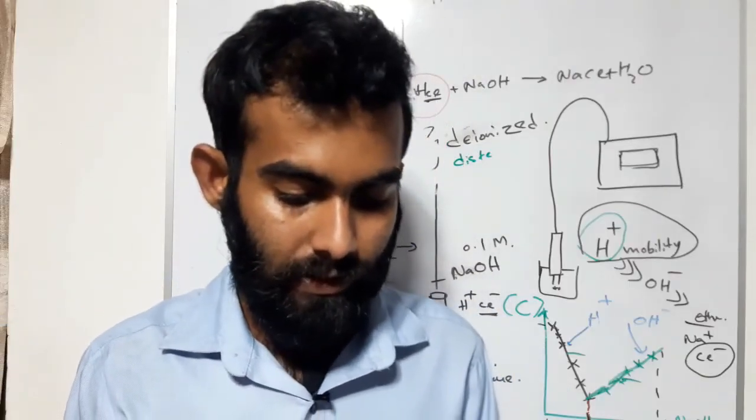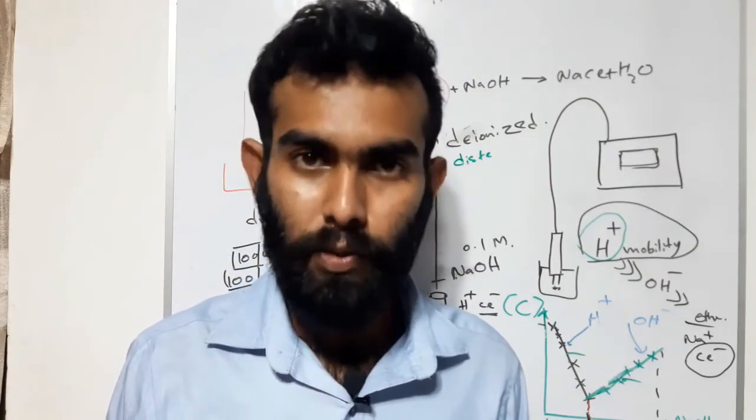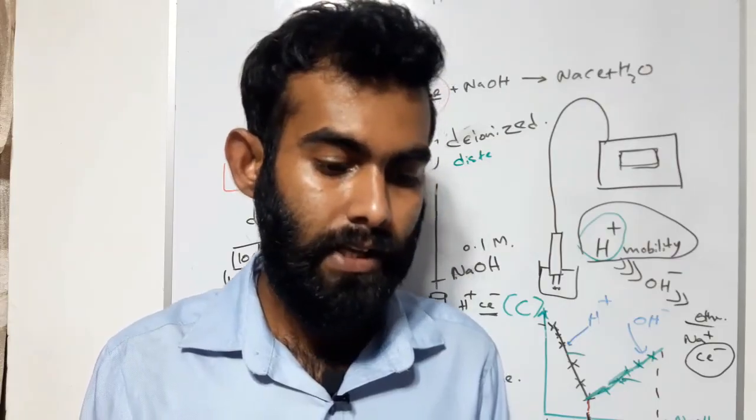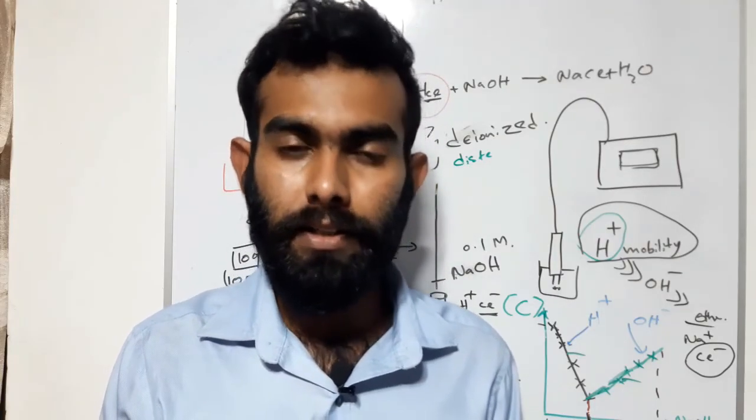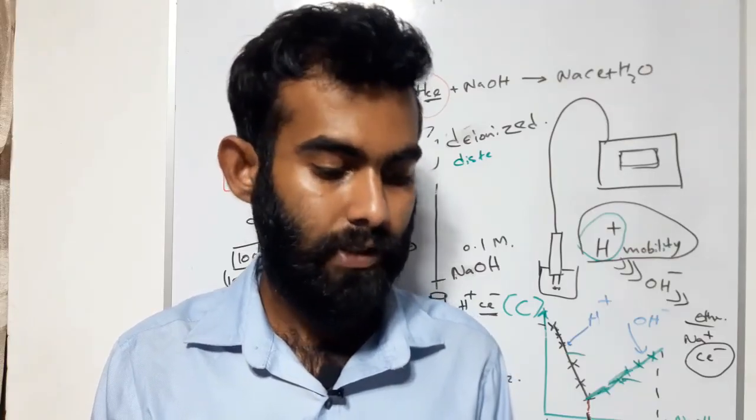Okay. That's the end of experiment number 5, which is the conductivity meter experiment. Now we will move on to the 6th experiment, pH meter.